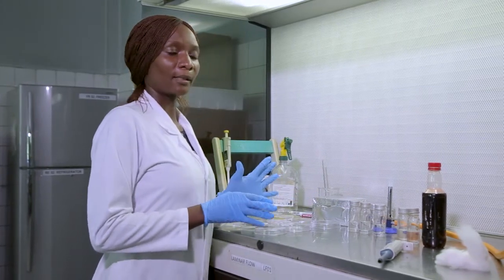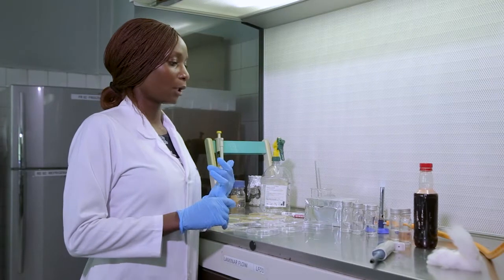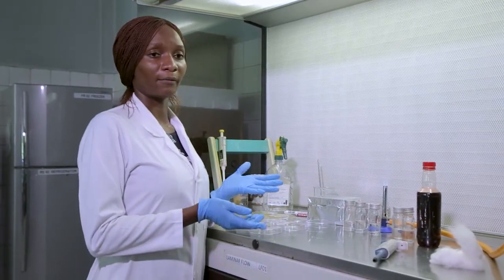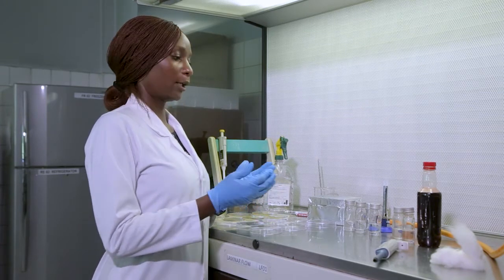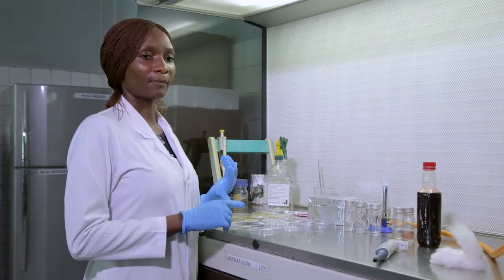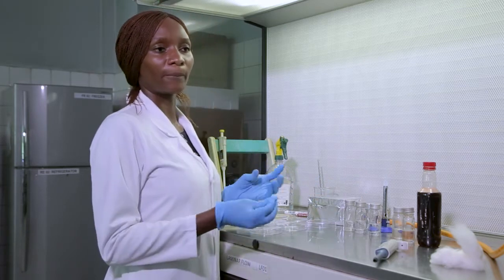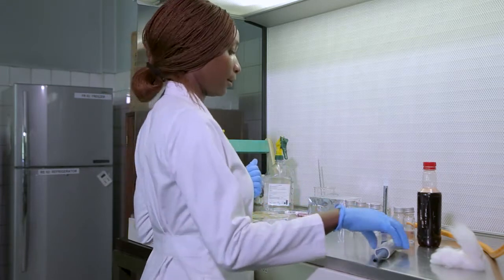If you suspect that the sample is highly contaminated, maybe if it is juice that is not pasteurized, you can make your serial dilutions as far as 10 to the power -8 or even 9. If you're working with fermented foods, usually use high dilutions. If you're working with a juice that has been pasteurized, any food that has been canned, you may actually not have to do serial dilutions because such samples are more or less sterile, so you will not be diluting anything.